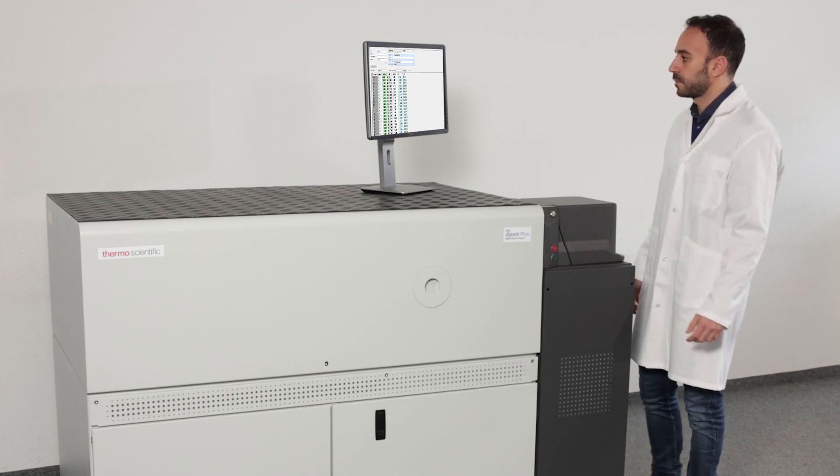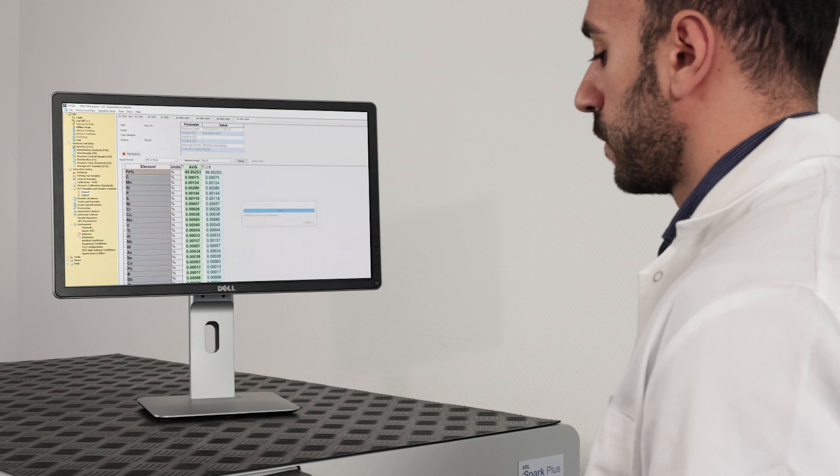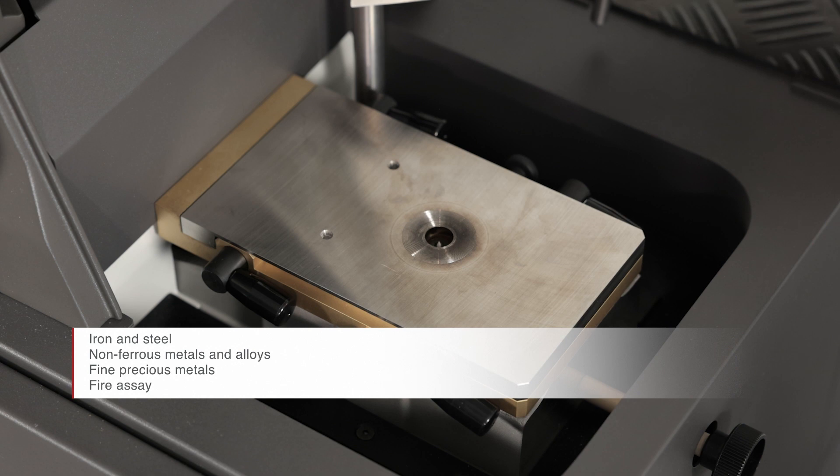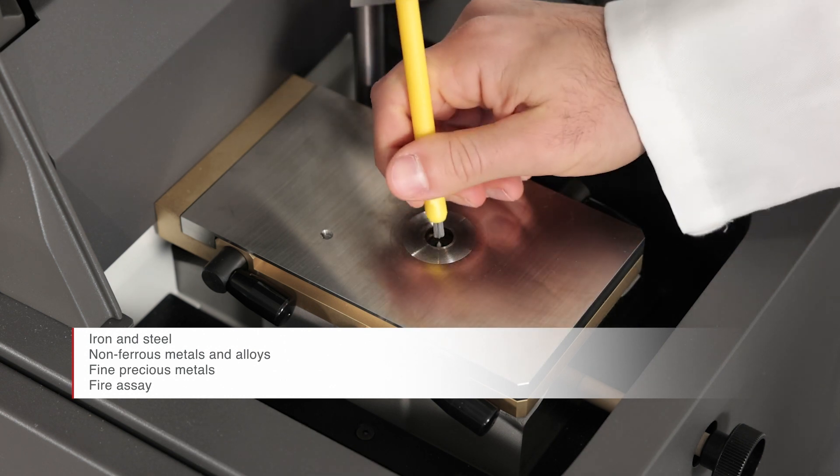It provides high-speed elemental analysis of most metals and alloys with industry-leading performance, simple operation and maintenance, and low operating costs.